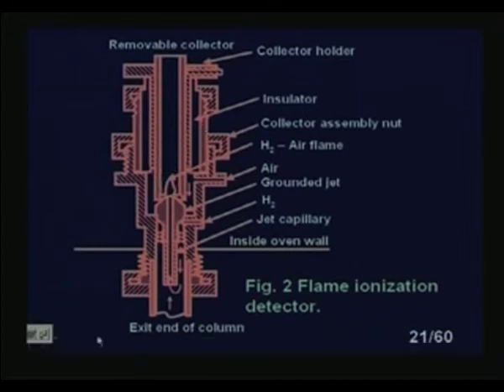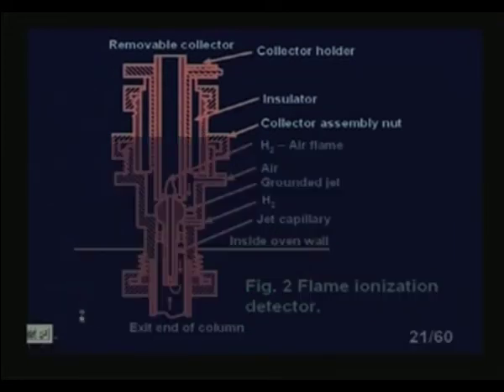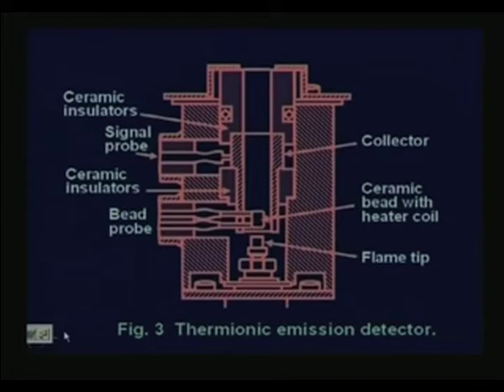Now, if I look at the thermionic emission detector, you see this is the thermionic emission detector. It is principally something different. It employs a fuel-poor hydrogen plasma.